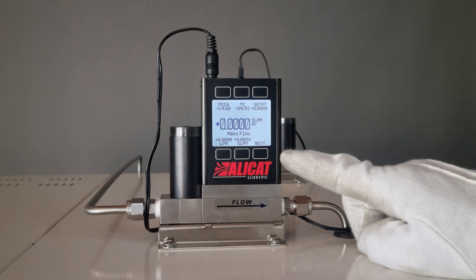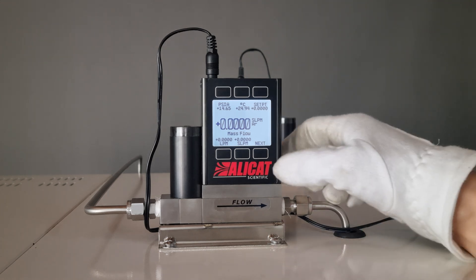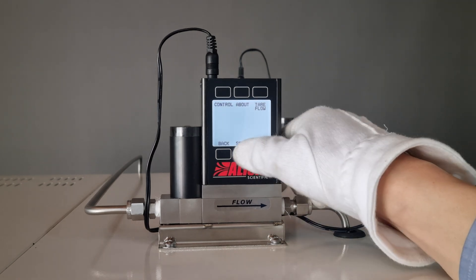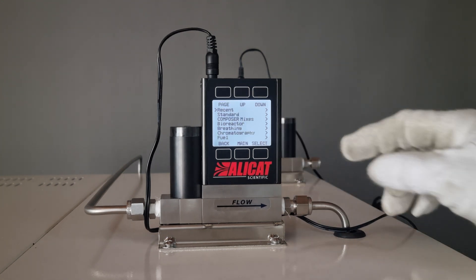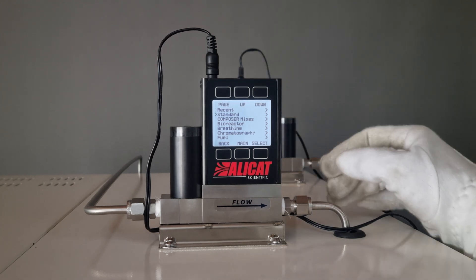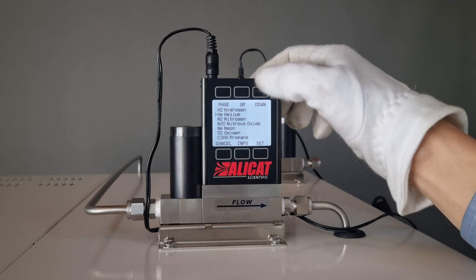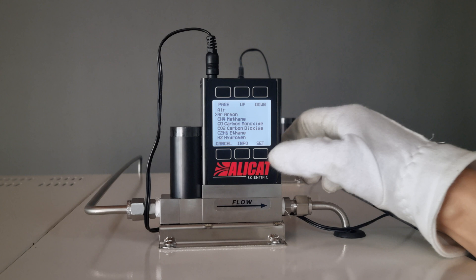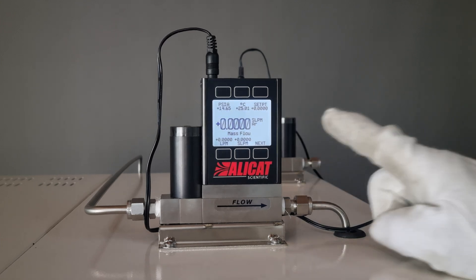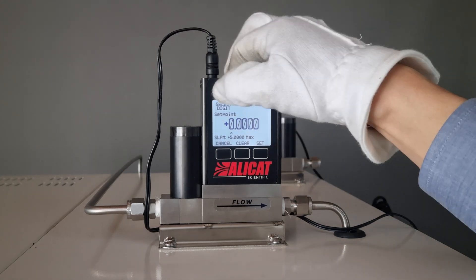On the screen, you can see the pressure, temperature, set point, volume, mass, and the menu button. Click Next, Menu, Setup, and Select. Use the Up and Down buttons to go to Standard. Now you'll see Air, Argon, Methane, CO, CO2, Ethane, Hydrogen, Nitrogen, and so on. Since we're using Argon for demonstration purposes, I'll select it and then click Main to return to the main screen. Then click Setpoint and input your mass — I've set it to 500 milliliters.